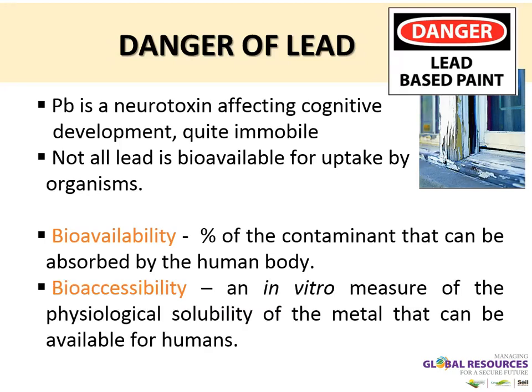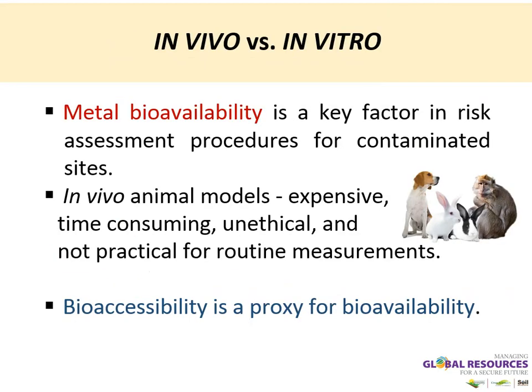So the alternative for bioavailability is an in vitro measure that is called bioaccessibility, and it's a measure that is performed in the lab, which is considered as the estimation for bioavailability. So how are both done? Metal bioavailability is the key factor in risk assessment and procedures for contaminated sites. Right now, the most common way to measure bioavailability is to test on animals, which is called in vivo studies, which is very expensive, time-consuming, unethical, and not practical. So bioaccessibility is the key and the proxy for bioavailability that should be used.